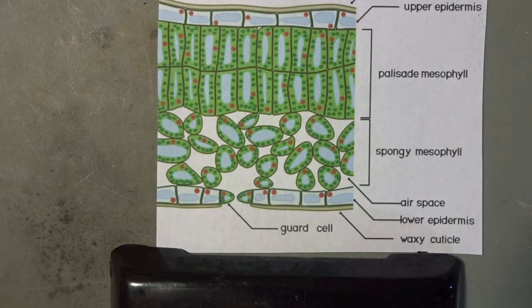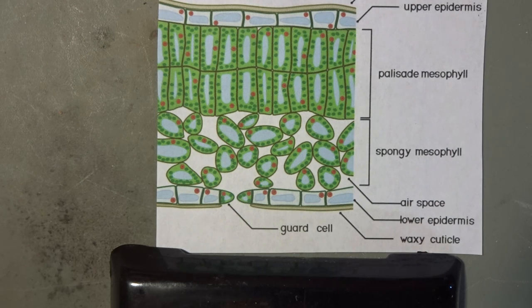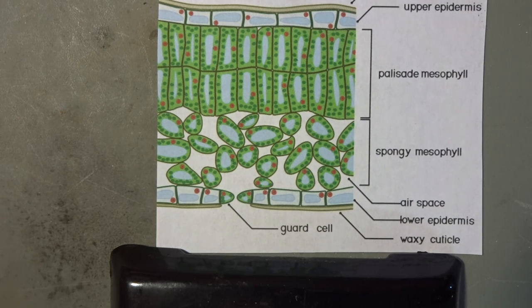Xylem are vascular bundles that conduct water from the roots of a plant up through the entire plant to the leaves. Nutrients are transported from the leaves down to the roots of plants by the vascular bundles called phloem. The palisade mesophyll layer is where most of the photosynthesis occurs in the leaf by means of chloroplasts. To maximize light absorption, the palisade cells are closely packed together. The spongy mesophyll allows the interchange of carbon dioxide needed for photosynthesis, and the spongy mesophyll cells are less likely to undergo photosynthesis than those in the palisade mesophyll.